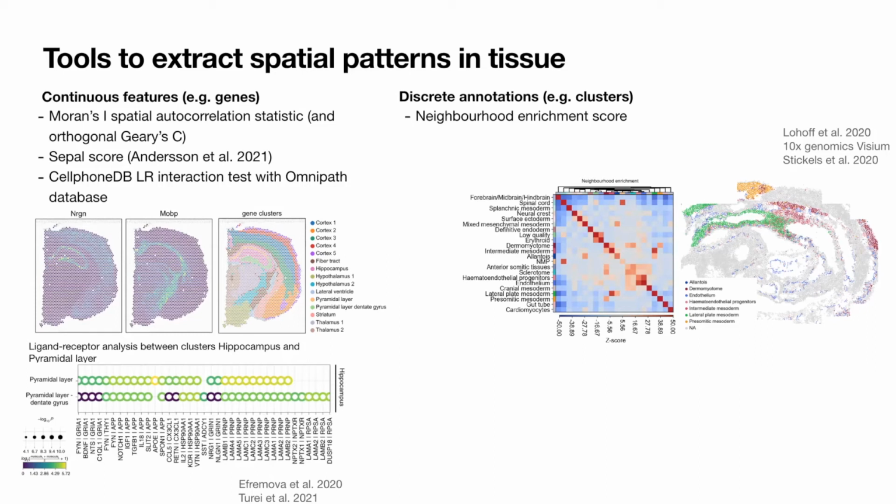Sorry, you can't see my cursor. This is, let me see if I can get the names. Well, this is essentially the red dots on this matrix on the right-hand side that I colored in the actual tissue image, and you can see how they're actually close to each other and closer to each other than would be expected by random chance. So for this, you can figure out which clusters, maybe which cell types, are close to each other and are enriched with each other.